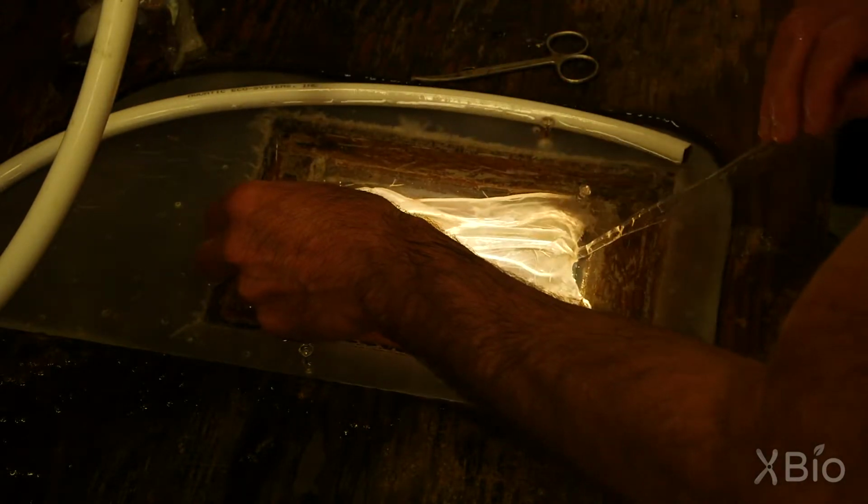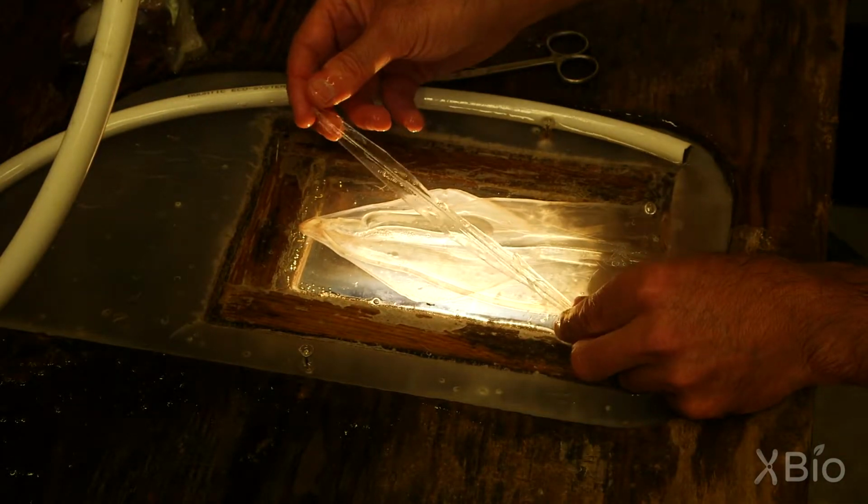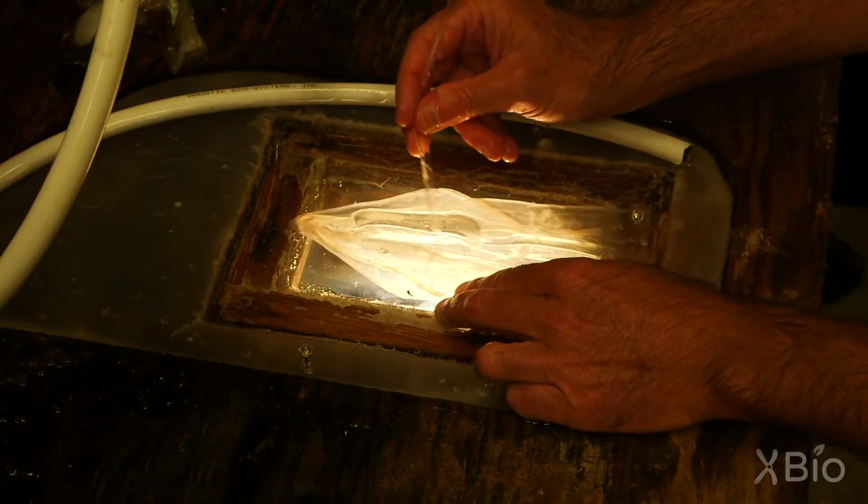And this is the cartilaginous backbone of the squid, which is called the pen. And you can see it looks like an old-fashioned writing pen. And I can also use this to point to different parts. So all of these lines that you see here are axons. They're all coming from this body of neurons right here. So all of these are innervating the muscle.